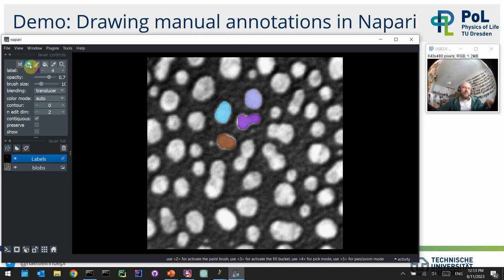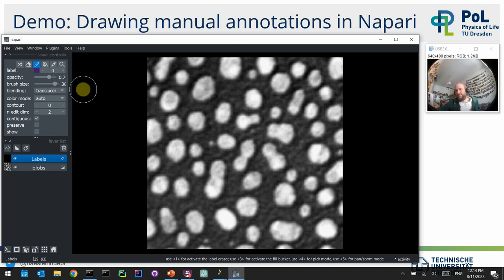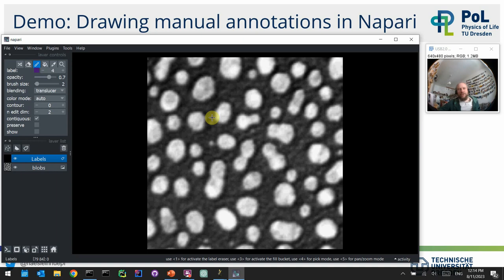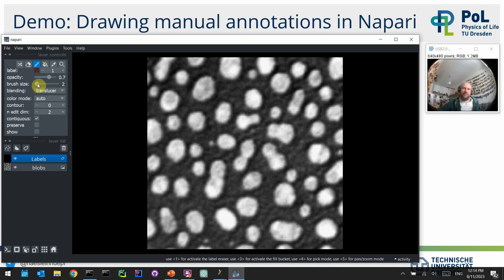The eraser tool is also quite helpful — I recommend changing the radius as well to erase segmentations. Going back to the paintbrush tool: if you work with pixel classification, particularly classical machine learning random forest classifiers, it's not recommended to fill out entire objects. It's better to draw thin lines. With a brush size of two, you can draw background with label one and foreground with label two — this is semantic segmentation rather than instance segmentation.